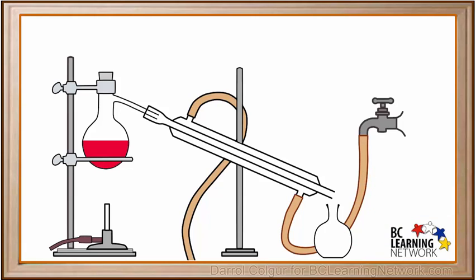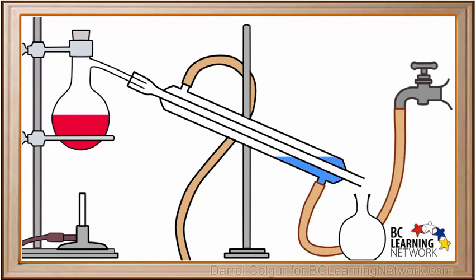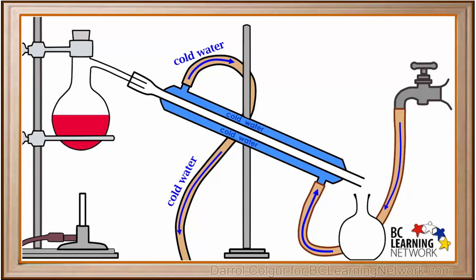Now we'll attach the hose on the bottom of the condenser to a cold water tap. When we turn the tap on, cold water runs into this hose. The cold water fills the outer jacket of the condenser. After the jacket is filled, the water comes out of the top and drains out through the hose on the left, where it goes into a sink. Cold water keeps circulating through the outer jacket of the condenser.